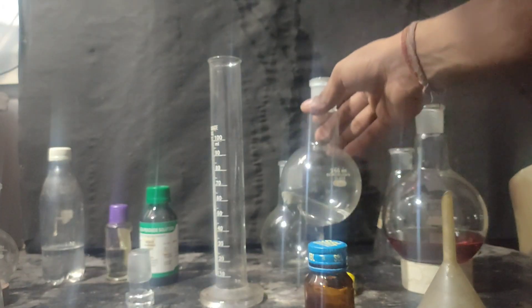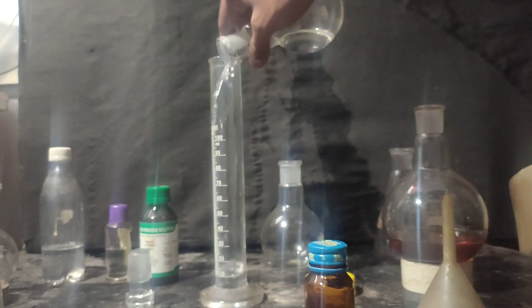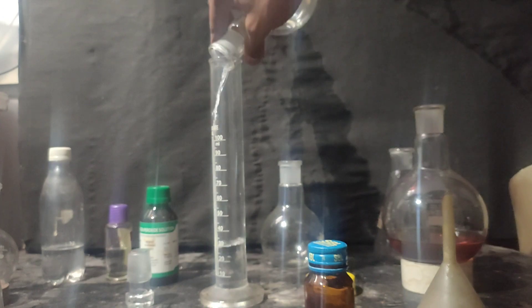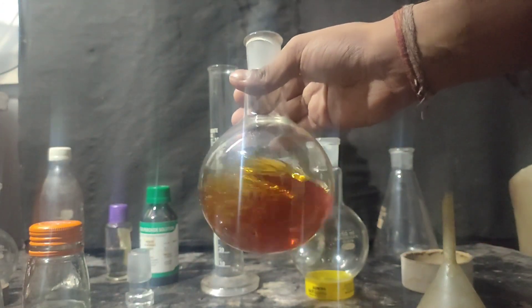This is the fourth fraction that came above 105 degree celsius. And its volume is around 35 ml. This consists mostly of toluene. And this is the leftover petrol.